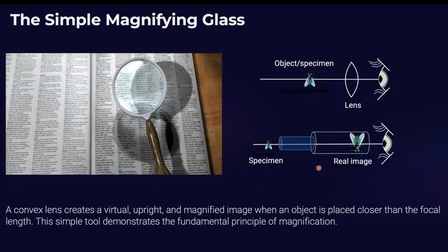We have to remember the telescope progressed much more rapidly than the microscope. Microscopes took almost 6 centuries. And that's exactly why we will look into the historical development. The first part, the evolution of the microscope. The microscope starts already in the 13th century.